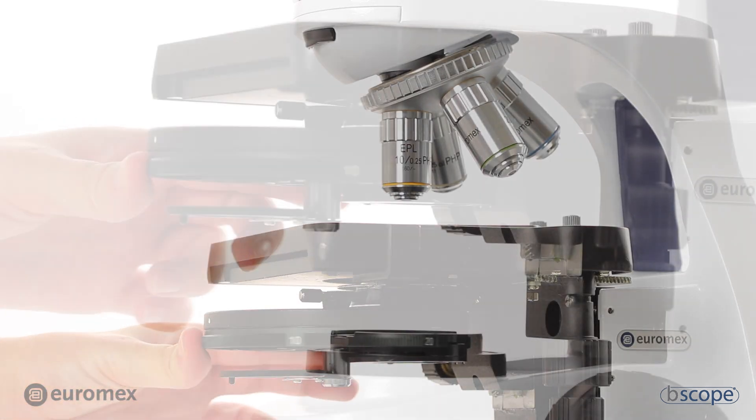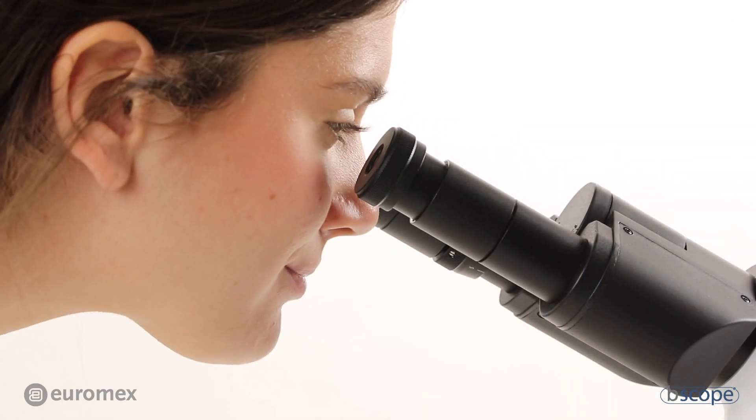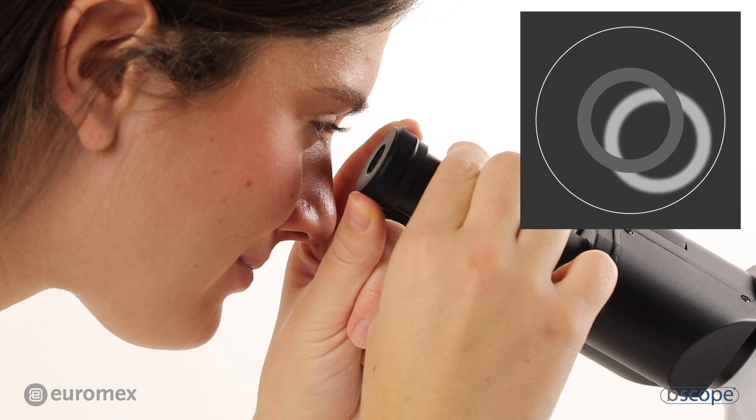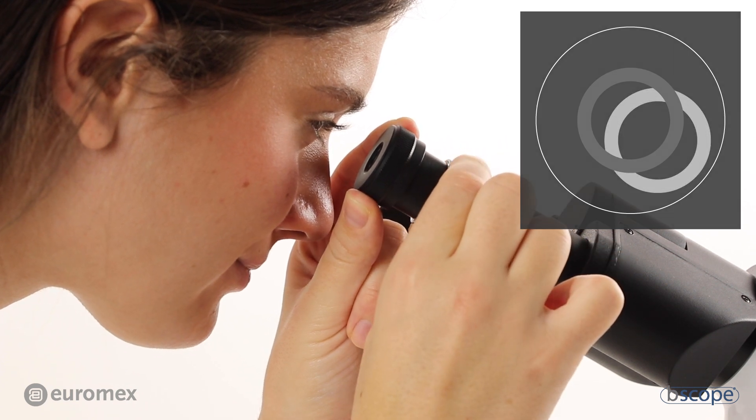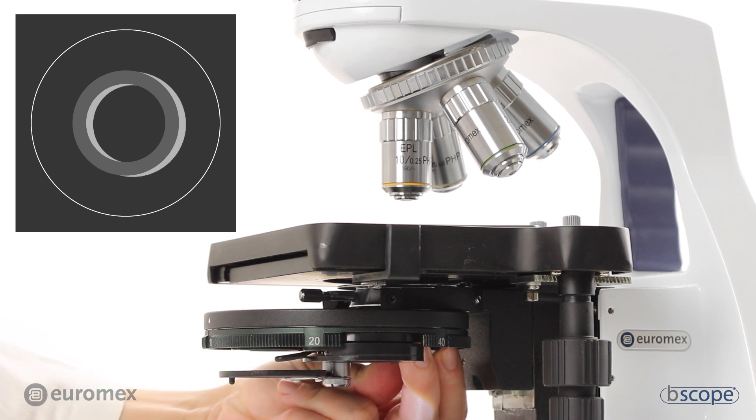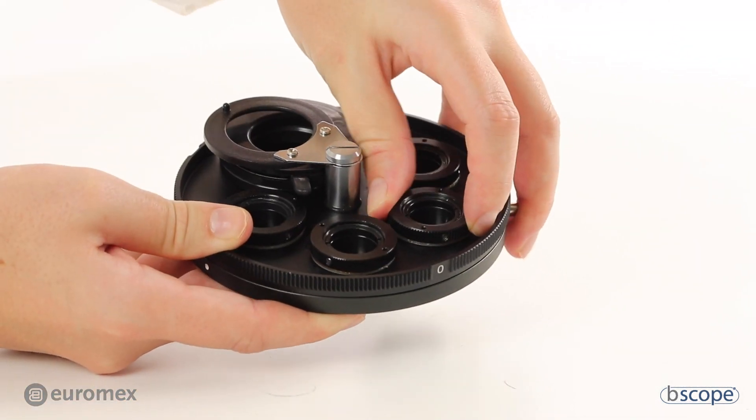Turn the selector to 10. Focus on the annulus, white ring, and adjust the annulus for the 10 times objective by moving it. This gives you an idea of what actually happens.